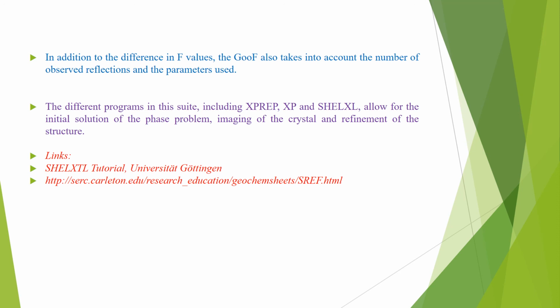The different programs in this suite, including XP, XPREP, XT, and SHELXL, allow for the initial solution of the phase problem, imaging of the crystal and the refinement of the structure.